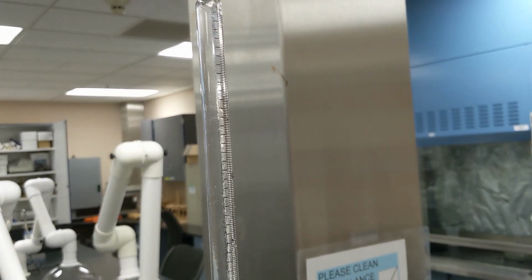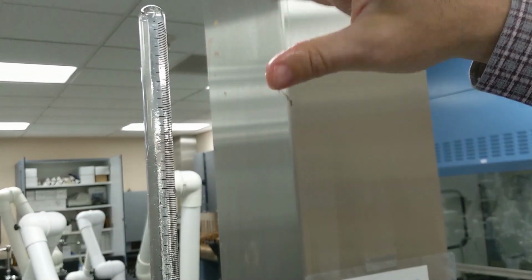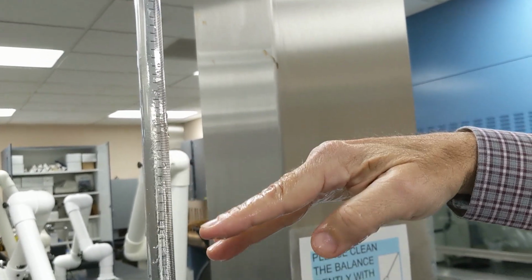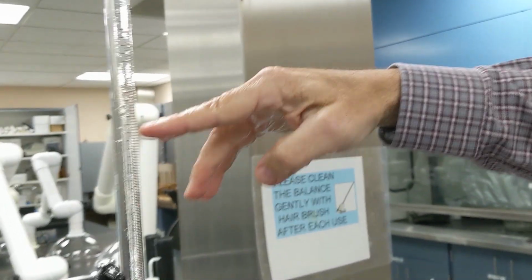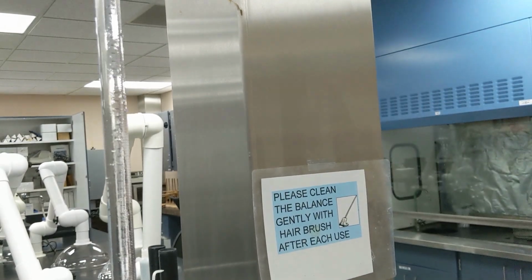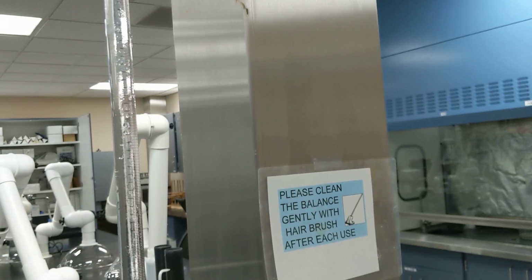Okay, so what's happening is at the bottom of the eudiometer, which is now inverted, so it's the top here, we have the concentrated hydrochloric acid, and it's mixing with the water. So these little swirls that you see are due to the refractive indexes of these solutions being different. So even though they're both colorless, we can see that they're actually mixing.